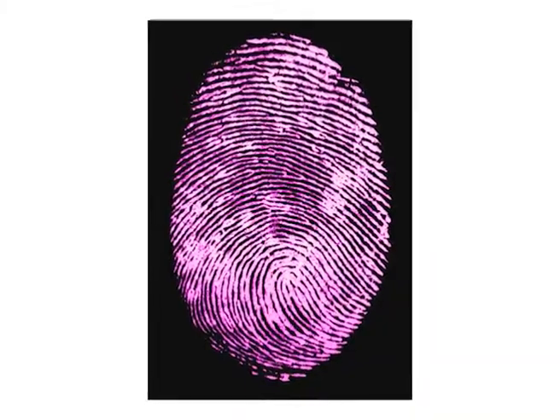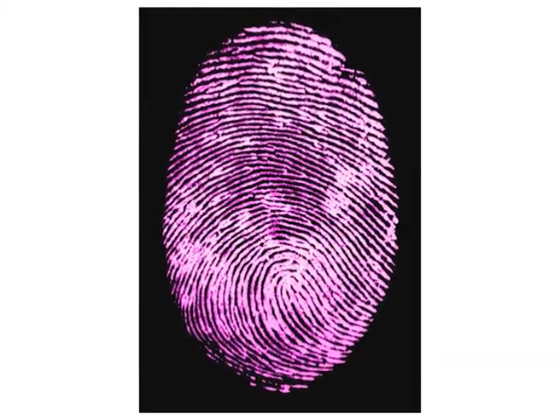The emission wavelength of the latter device, that is around 532 nanometers, closely matched with the absorption band of the benzo-F-ninhydrin amino acid zinc chloride complex. An isomer of benzo-F-ninhydrin, that is benzo-E-ninhydrin, gives good quality pink colored prints.